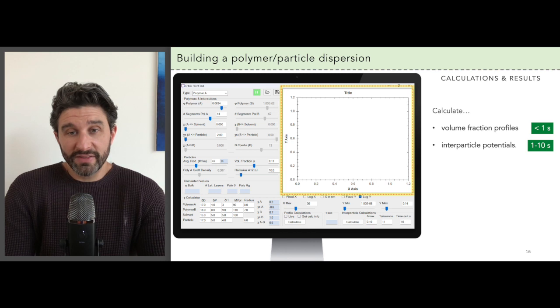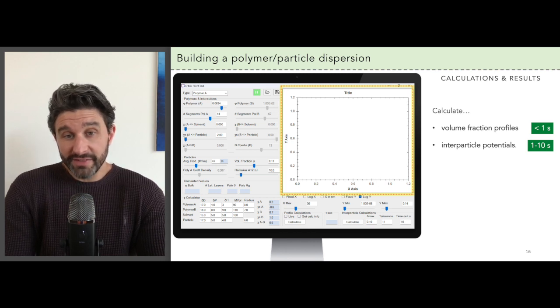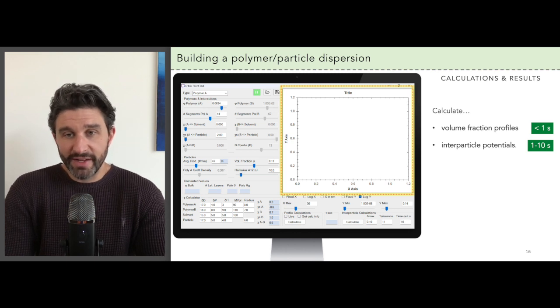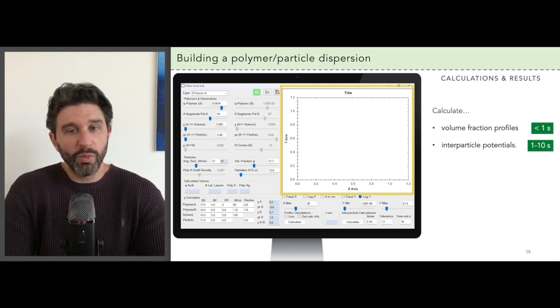For now the important point is that these calculations are really fast. The volume fraction profiles usually take less than one second to calculate, and then the interparticle potentials only take around one to ten seconds.